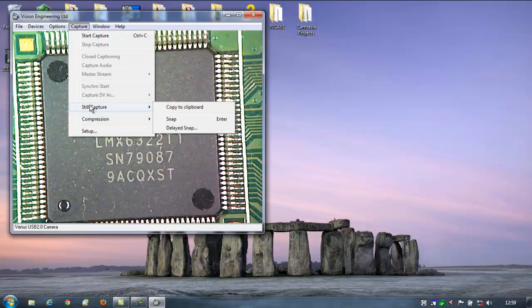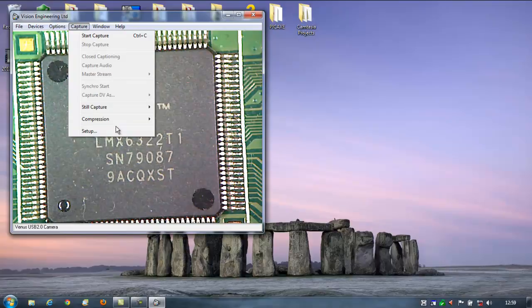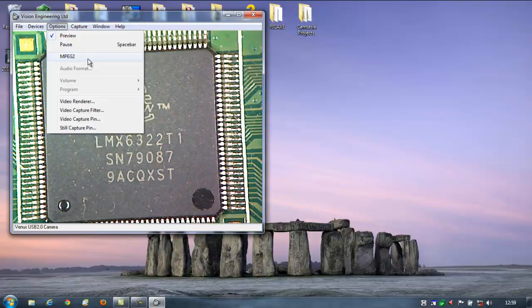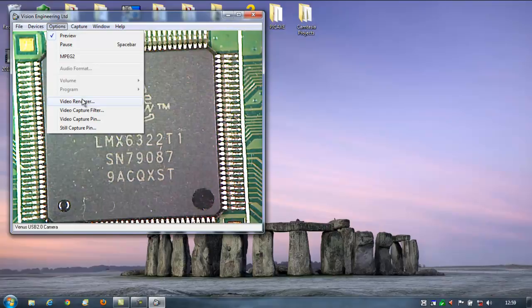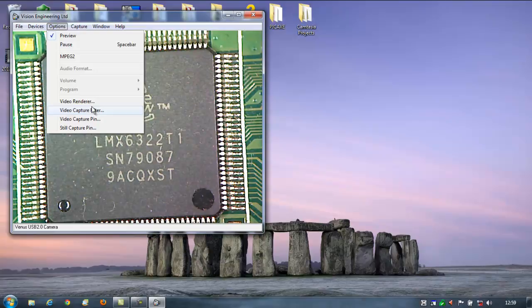I wouldn't want to work with it like that. But there, it's fine. Let's just go back to the chip. And it's stopped working again. Why is that? Oh, there we go. There's some processing problem there. If I swap between images, I'm still not happy with the fact that that chip looks twisted. In the display, I would say that clearly means the camera has not been mounted correctly, and it needs to be unscrewed and turned slightly and then locked back in place. That's just the lack of attention to detail, which is going to annoy me. I might speak to Vision about that.